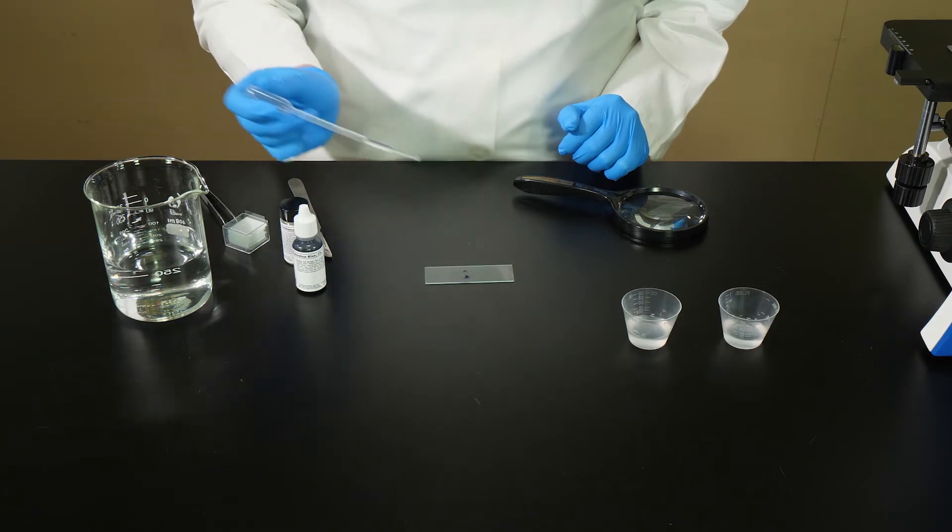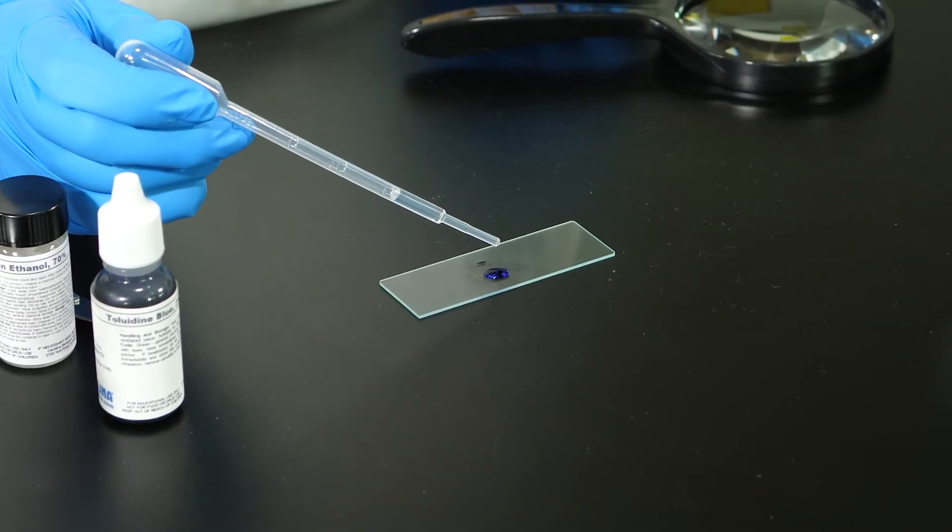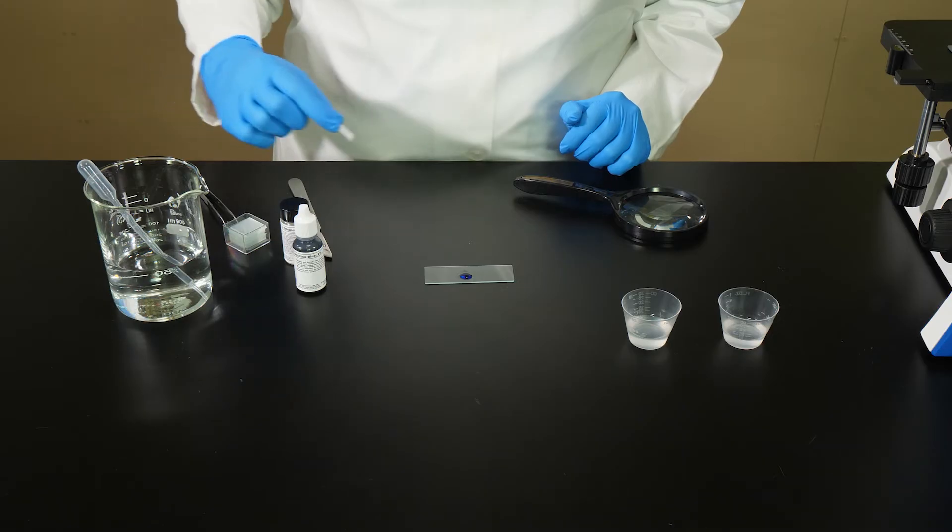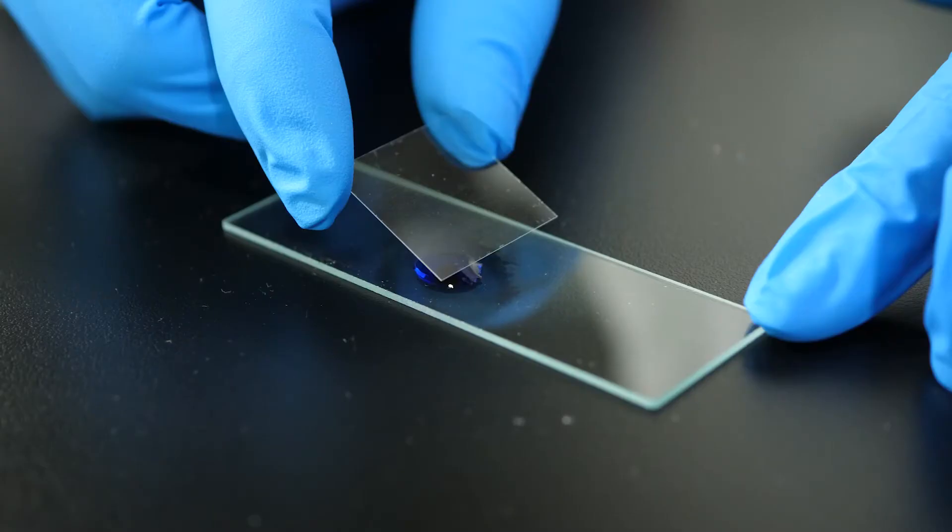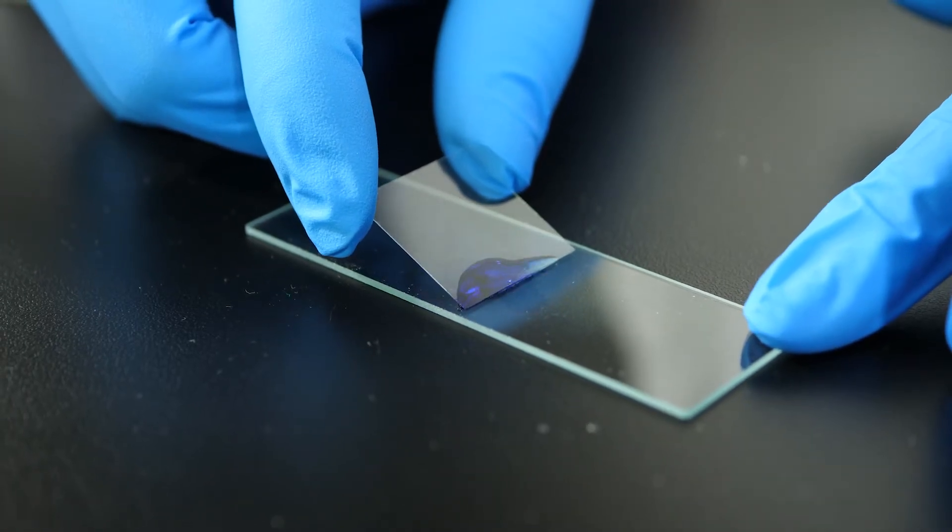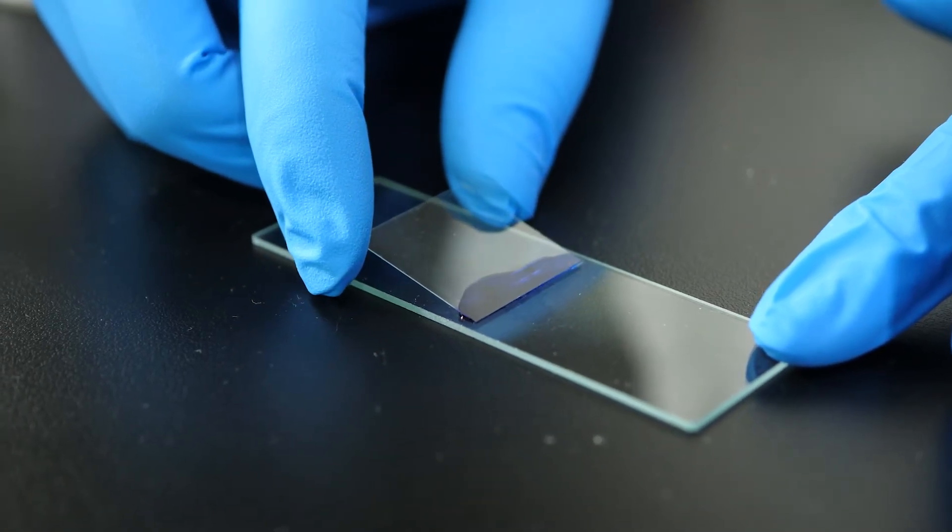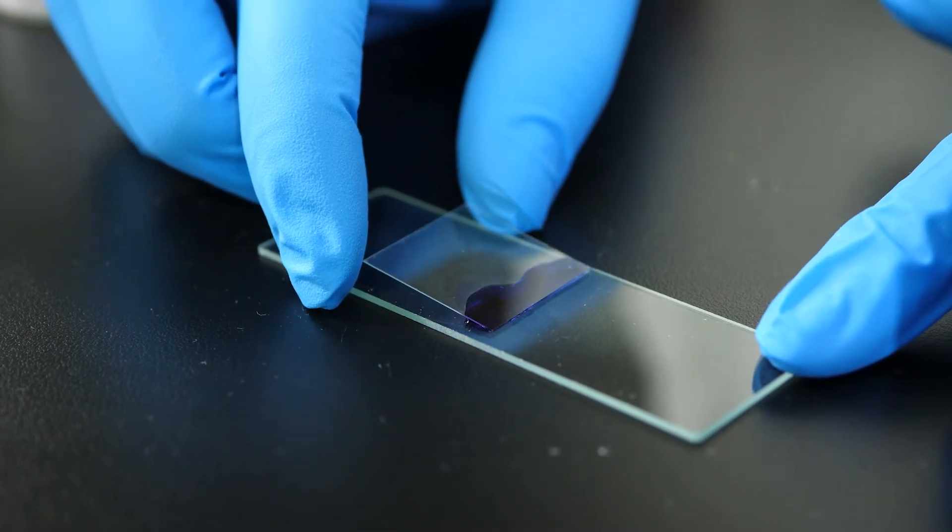Using a pipette, we add two drops of water to the sample and cover it with a glass cover slip. To keep from trapping air bubbles under the cover slip, we place one edge of the cover slip against the slide and gently lower the cover slip into place.